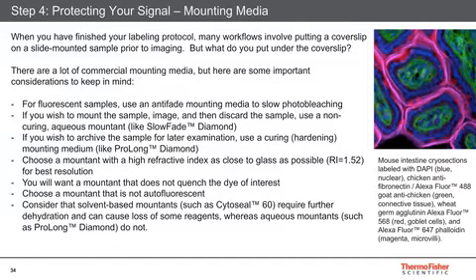So after you've labeled your cells, for instance, what do you do? Well, usually you put a cover slip on it. Sometimes if you're imaging in a well, that's not the issue. You just want to image in a buffer. But if you're using a microscope, there's a good chance that you're going to put a cover slip on there. And what do you put under the cover slip? That's your mounting medium. For fluorescent samples, it's very important to use an antifade mounting medium.